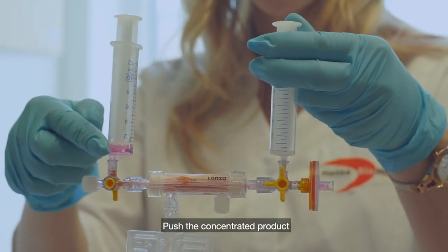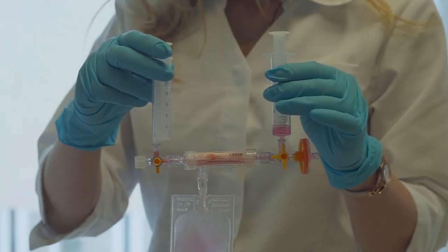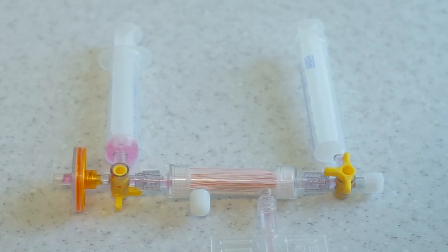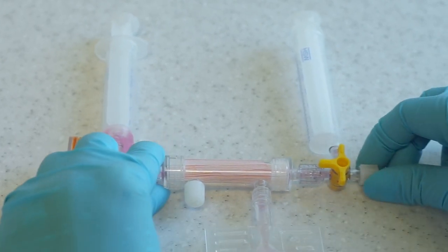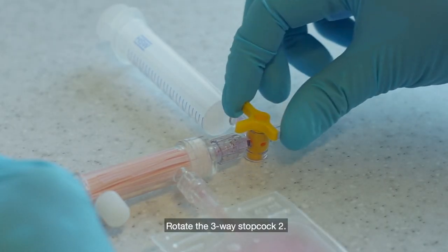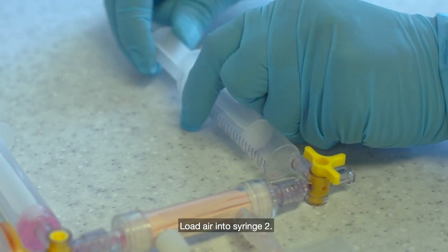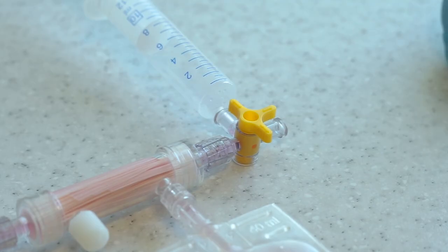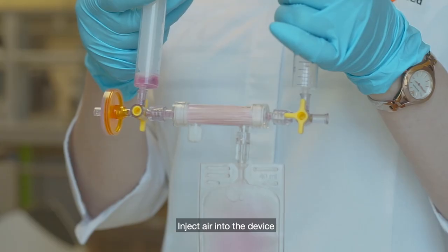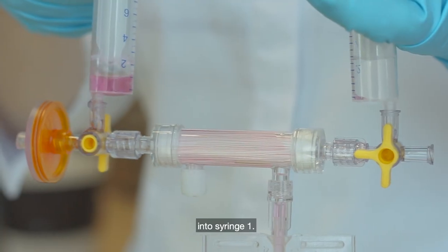Push the concentrated product into syringe one. Rotate the device so that the three-way stopcock 2 is accessible. Remove the cap from the small air filter connected to the three-way stopcock 2. Rotate the three-way stopcock 2, load air into syringe 2, then rotate the three-way stopcock 2 again and inject air into the device to collect all the residual volume into syringe 1.